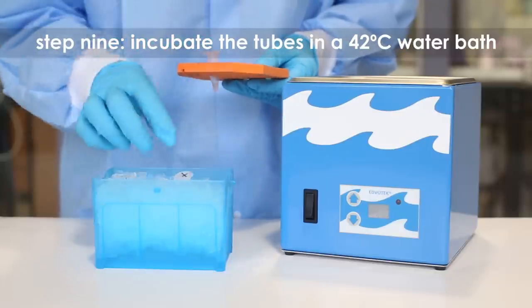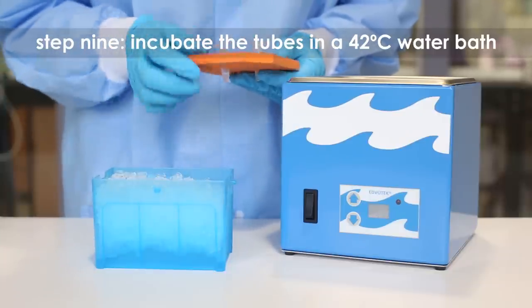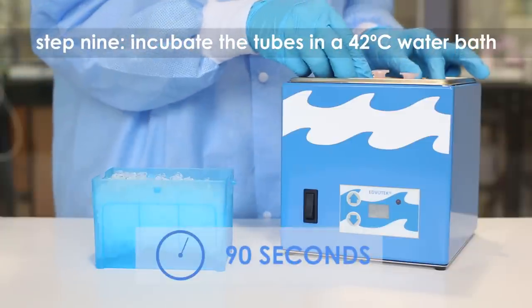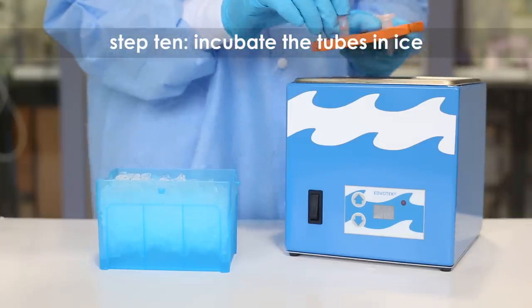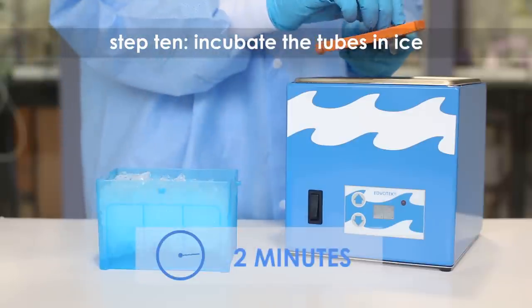Step nine: heat shock the cells by placing the transformation tubes in a water bath set at 42 degrees Celsius for 90 seconds. Step ten: immediately return the tubes to the ice bucket and incubate for two minutes.